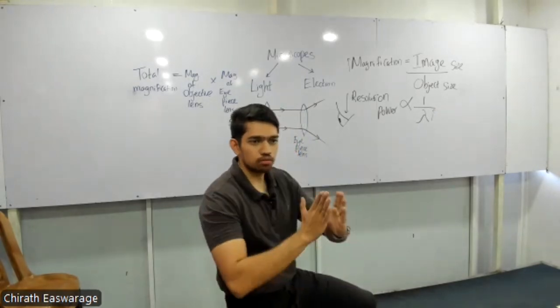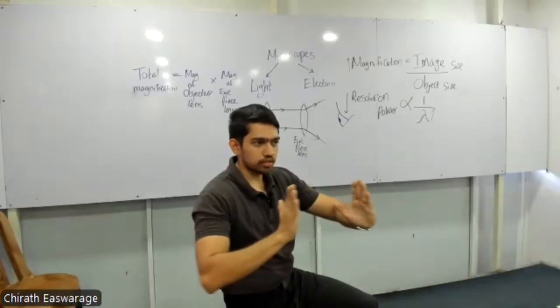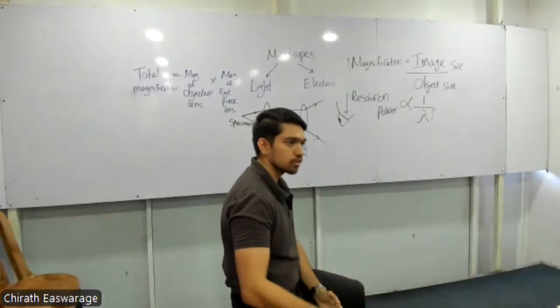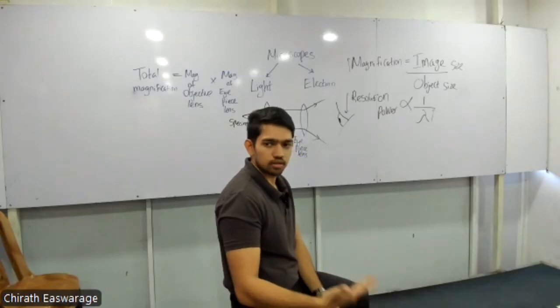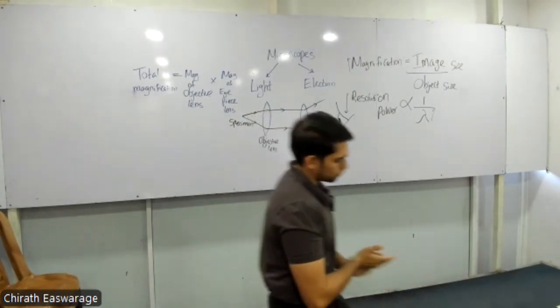You have to be able to move the lenses forward and backward to get a nice clear image, right? Means of focusing. What are the 3 things? Tell again. Source of illumination or light source, then magnifying lenses, then means of focus. Clear? Moving on.